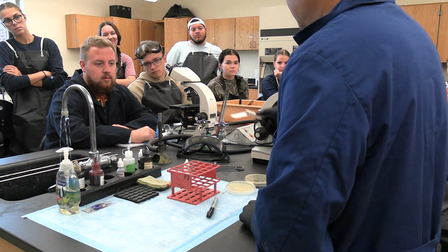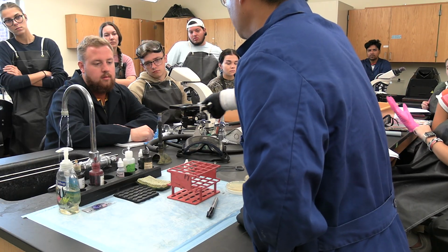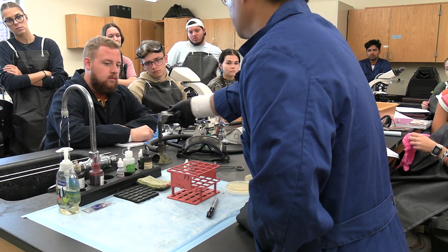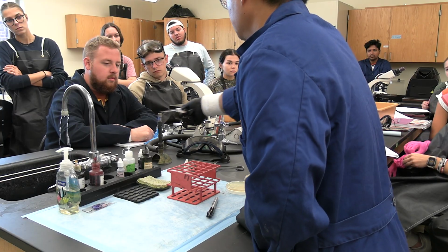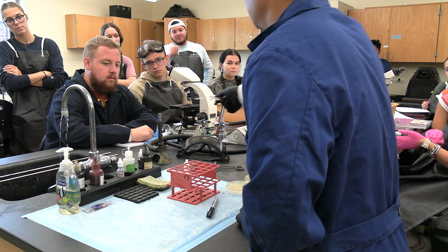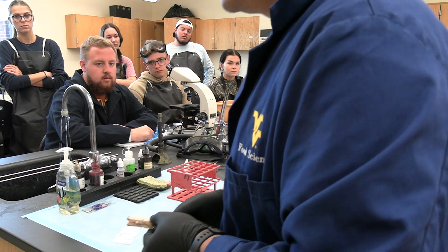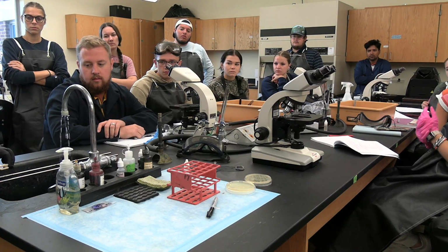We're going to do a heat fixing, so back and forth a couple of times. Like I said, this is not cooking. So back and forth a couple of times. You see it's almost dry, and that's ready. Then we don't need the burner, so we turn it off. Don't touch the slide right now, it's very hot. So we put it on the side.